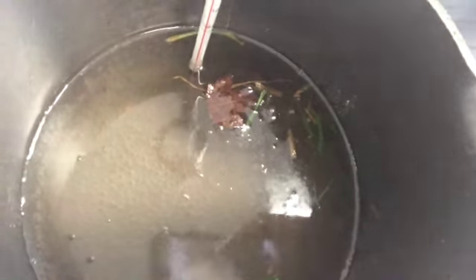All right, next 5 minutes is up. Our water is getting hotter and hotter. We can see now it's starting to bubble. We're getting some evaporation in there. Those water particles are getting up there.